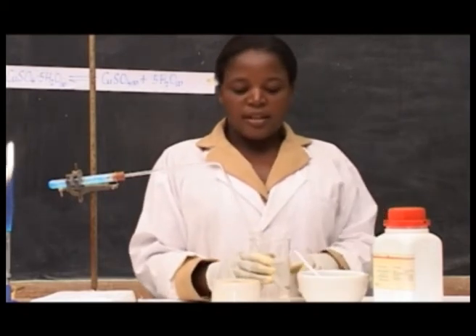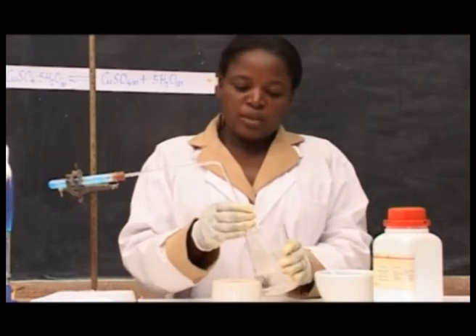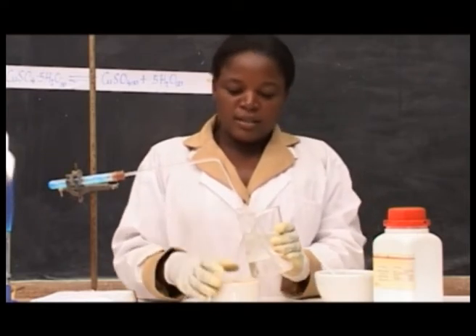Take a test tube and immerse it in cold water. Then immerse the delivery tube in the test tube which has been immersed in cold water.